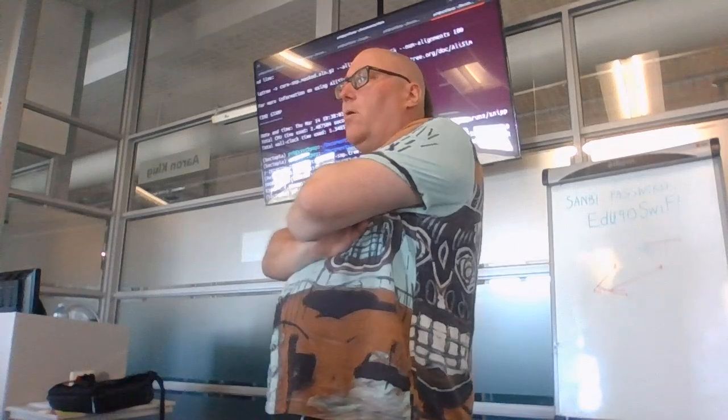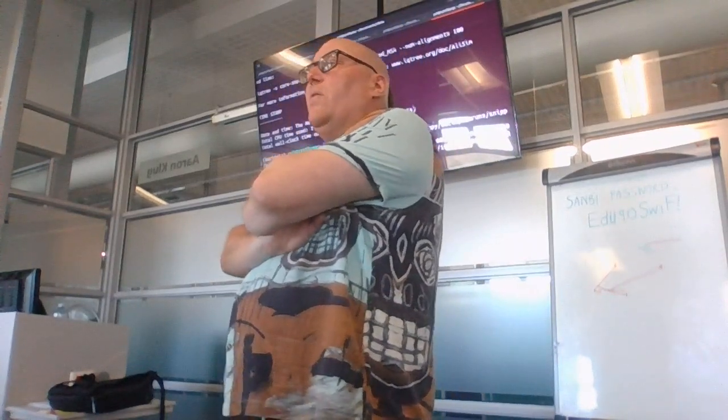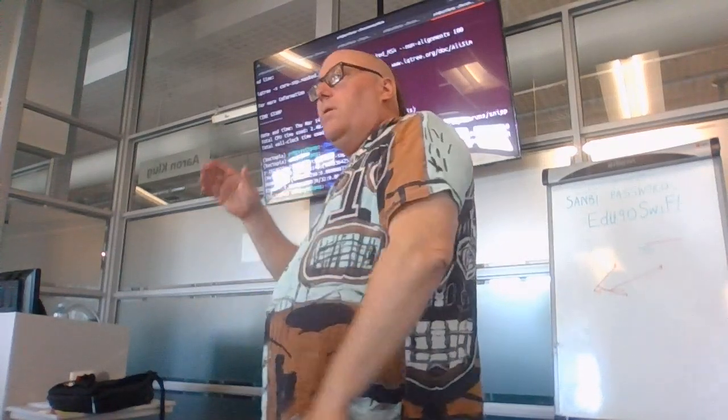Okay. Which workflow is that? The main Bactopia assemble workflow. If you just run Bactopia without the -WF command, I'm hoping I'll have time to show it tomorrow because I can't run it on my laptop, but I run it on the bigger server. Okay, and then that does various sketching and MLST prediction and things like that.